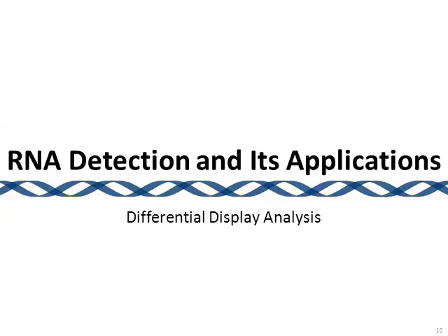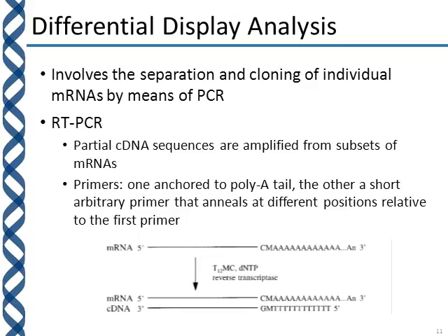First, we'll present differential display analysis. Differential display analysis involves the separation and cloning of individual messenger RNAs by means of PCR. The next step is RT-PCR.